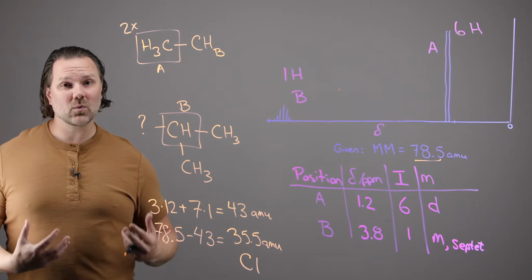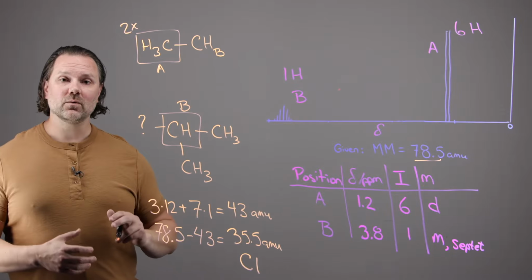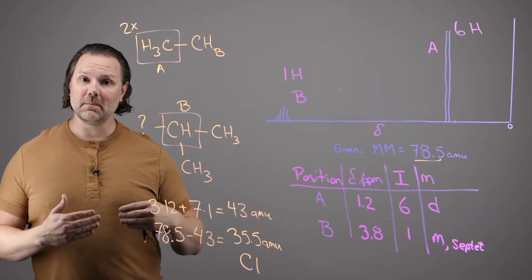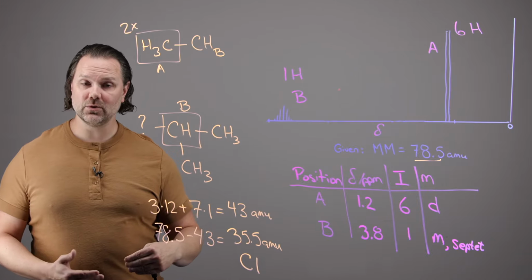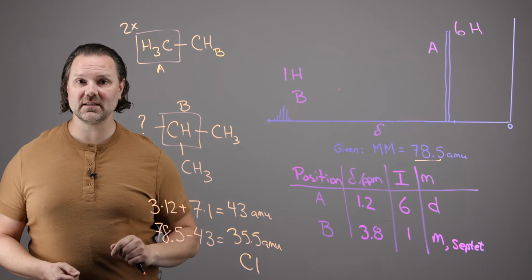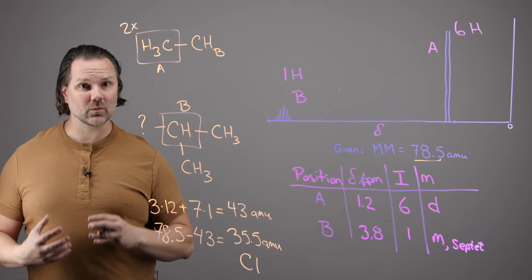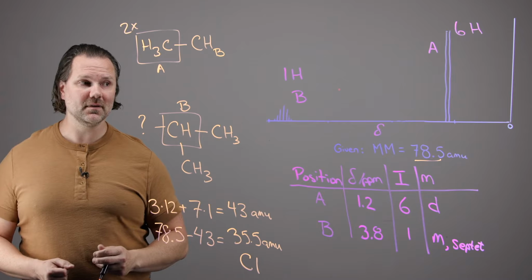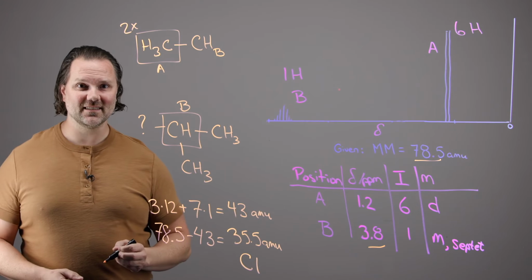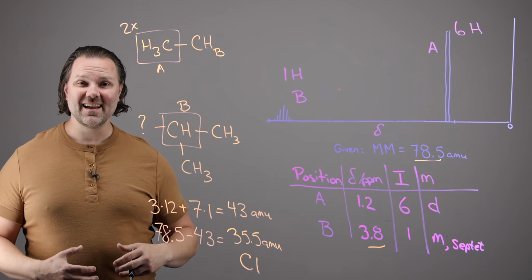It should be around 3.1 to 3.8 ppm, recognizing that the low end of that spectrum is for a CH3 group, the mid-range is for a CH2, and the high range of that is going to be for a CH. So we expect this CH group to show up around 3.8 ppm. And where did we say it shows up? 3.8. Exactly where our data sheet would expect.